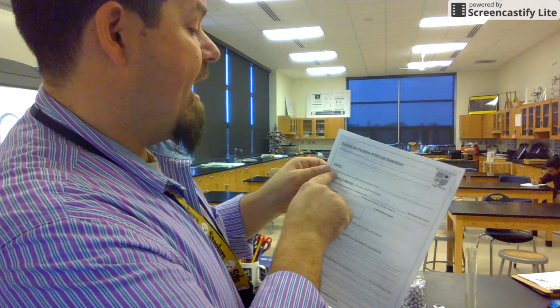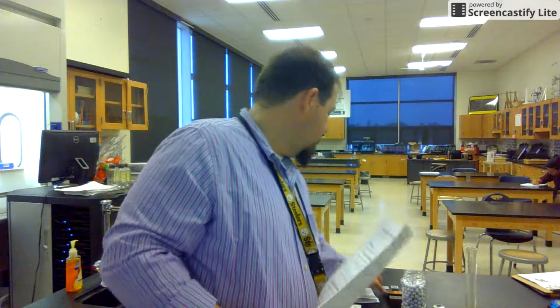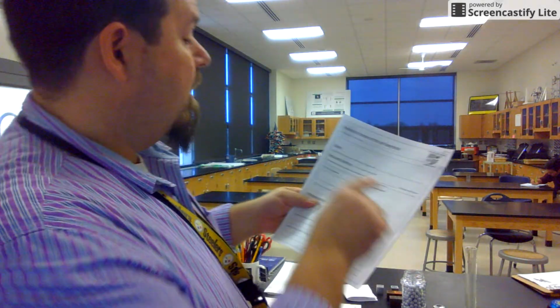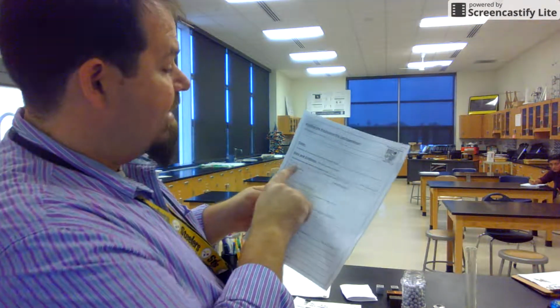The identity of my unknown matter in procedure 3 was... Well, which metal did you decide this block was, after you calculated its density? You're going to write that right there. So that's your claim. The metal was... Bam.